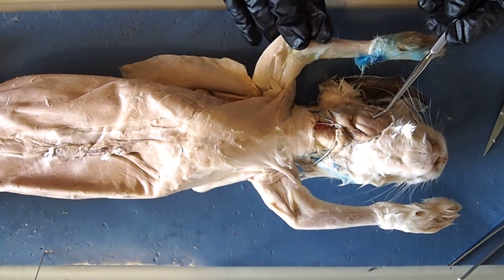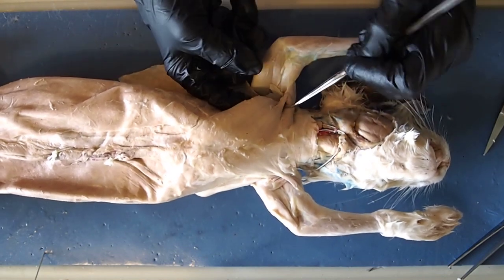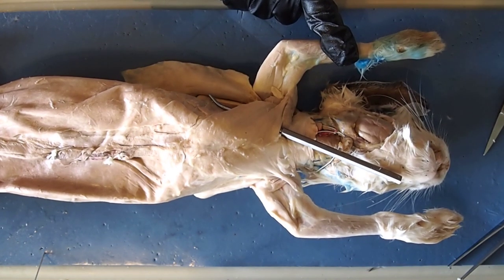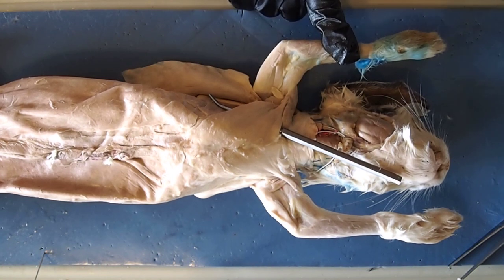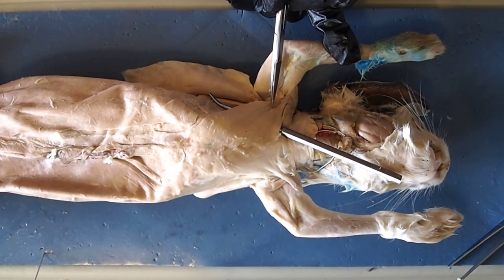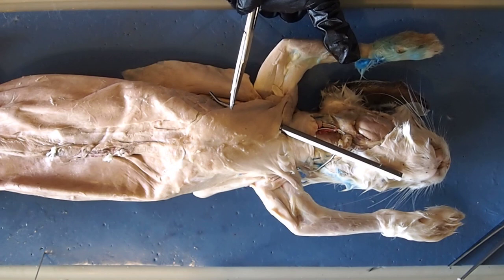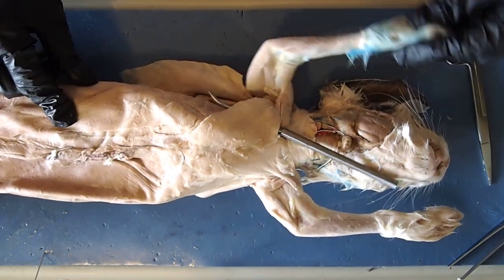Moving down a little bit, we see this triangular-shaped muscle here — these are your pectoral muscles, the pectoralis group. The pectoralis group is divided into two muscles: the pectoralis major and the pectoralis minor. For testing purposes, just be familiar with the name pectoralis. You can see that natural separation — pectoralis major on top and pectoralis minor running up under it.